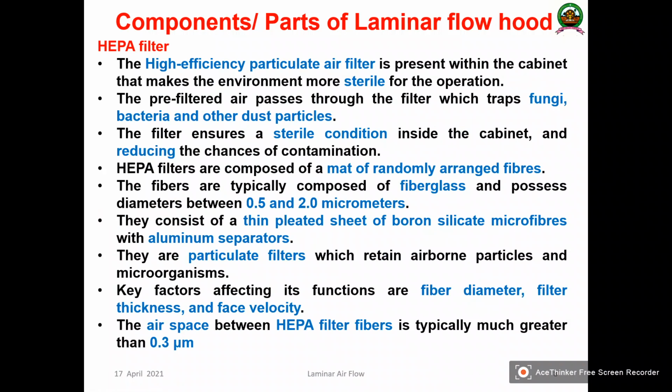The most important part of a laminar airflow hood is the HEPA filter, that is the high efficiency particulate air filter, which is present within the cabinet and makes the environment more sterile for the operation. The pre-filtered air passes through the filter, which traps fungi, bacteria and dust particles. The HEPA filter ensures sterile conditions inside the cabinet, reducing the chances of contamination.